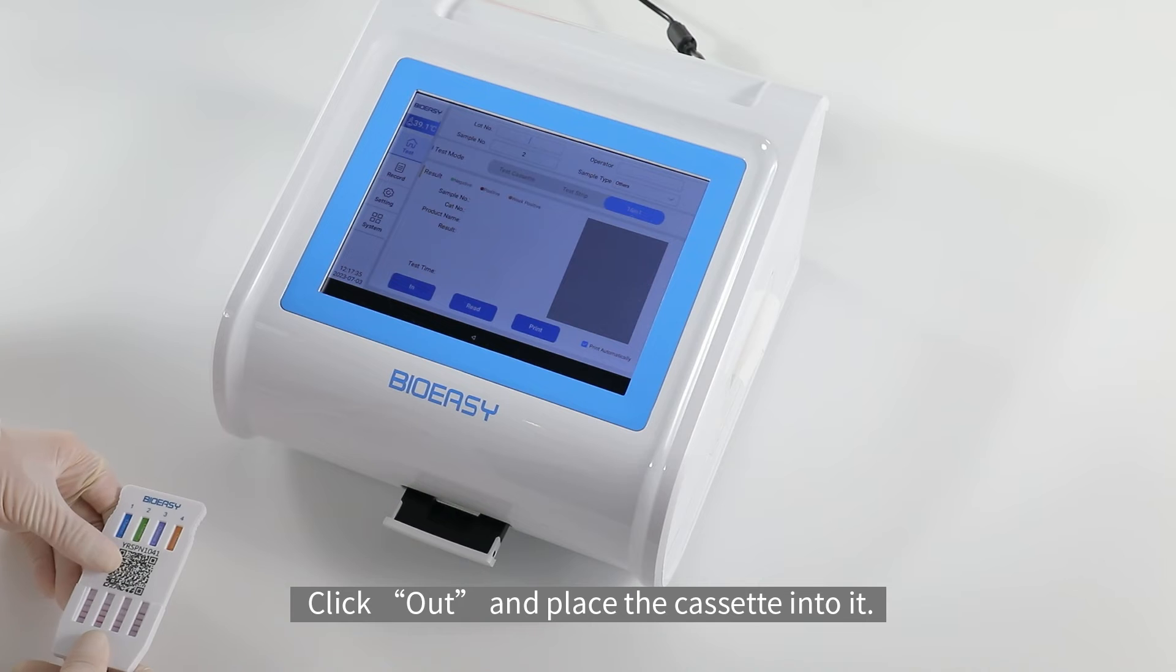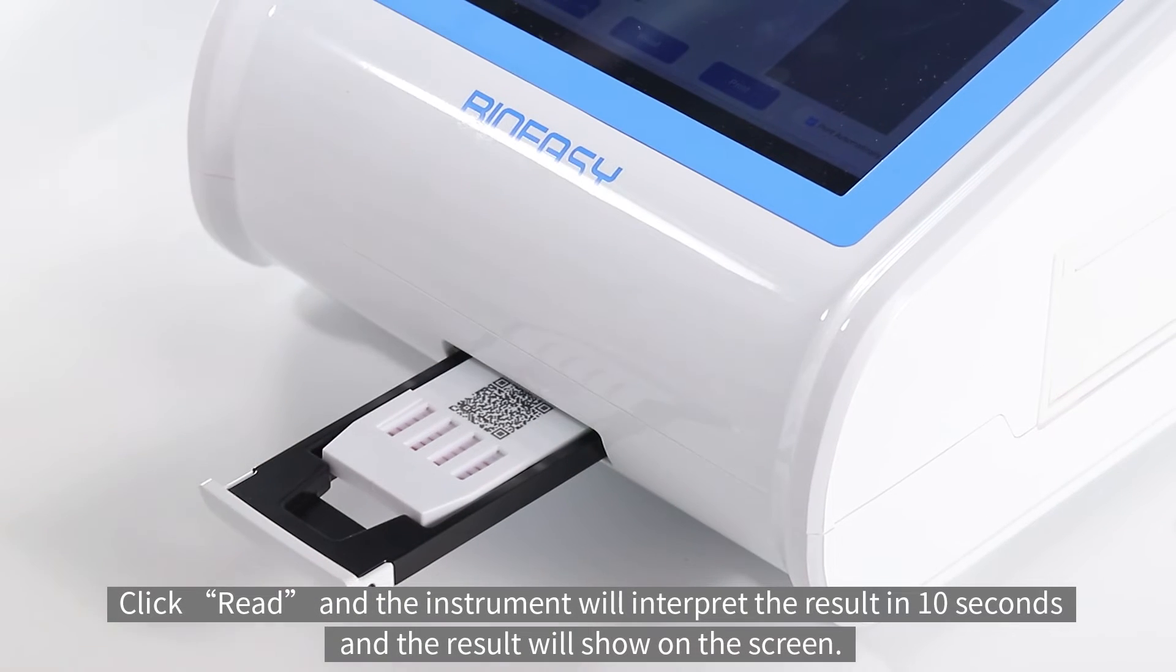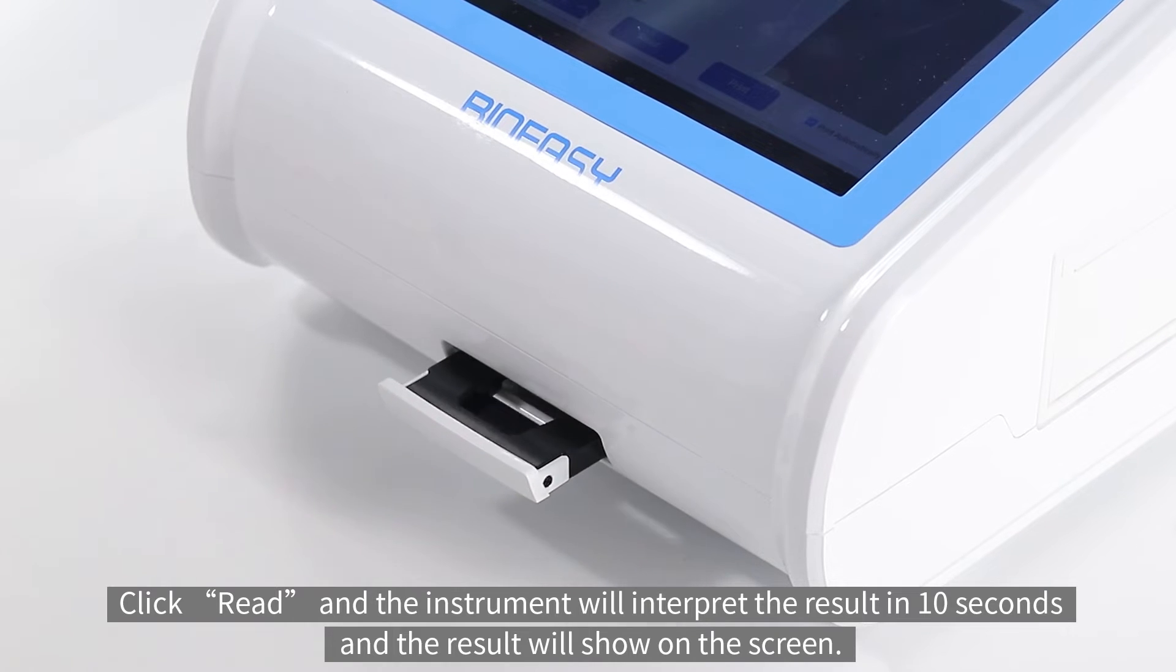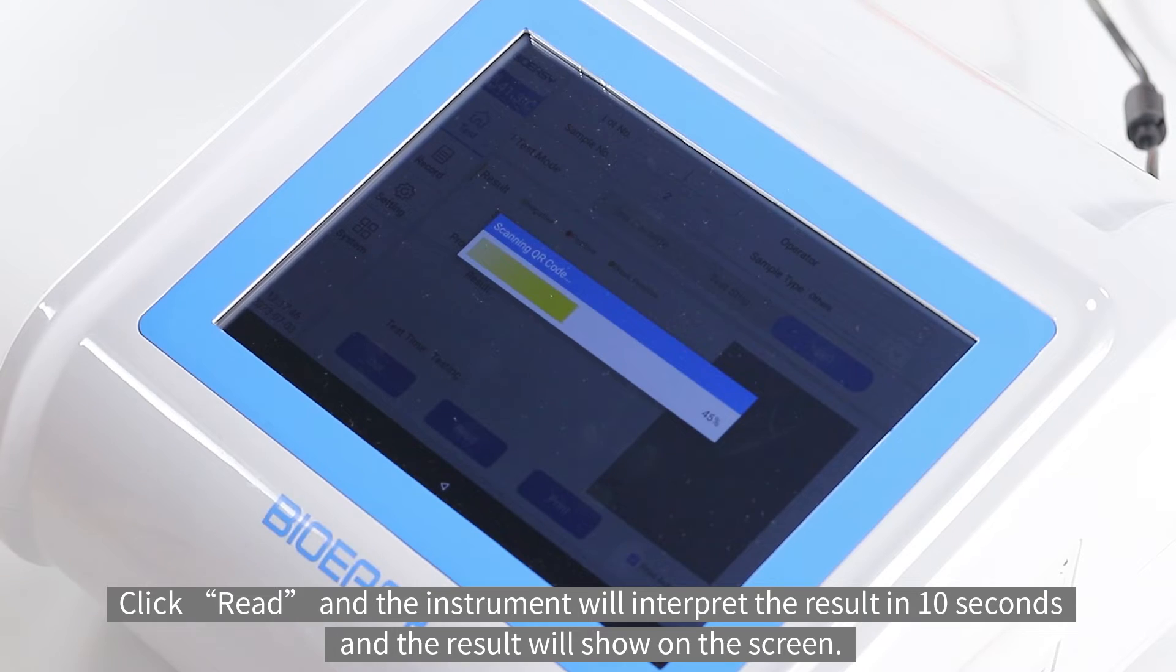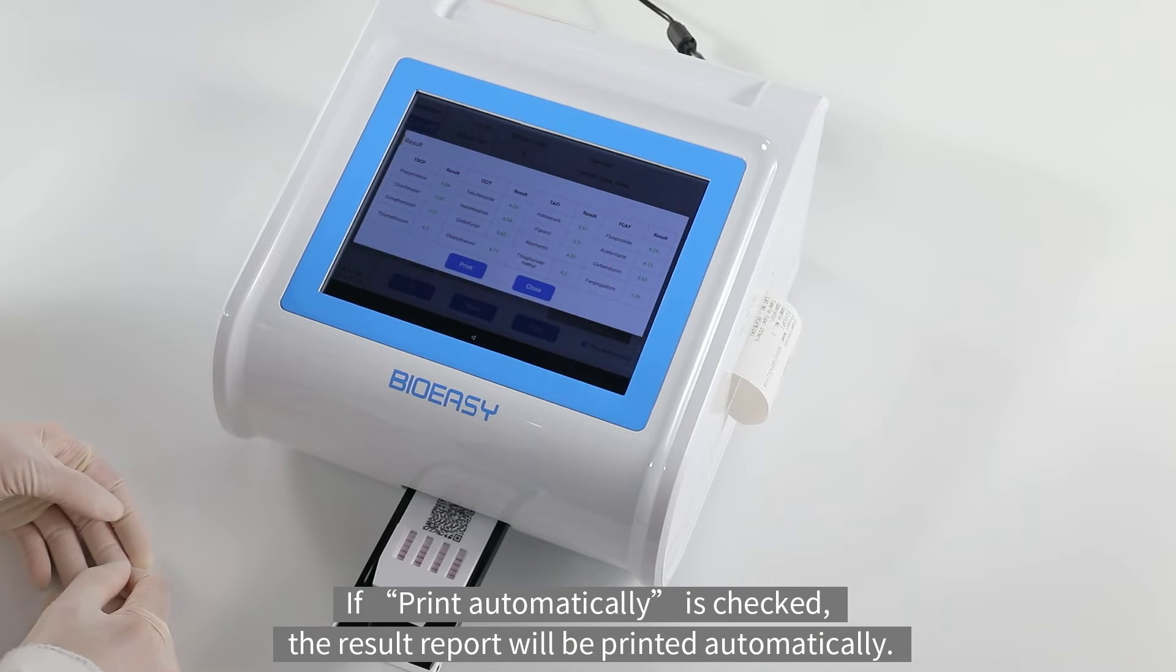Click out and place the cassette into it. Click read and the instrument will interpret the result in 10 seconds and the result will show on the screen. If print automatically is checked, the result report will be printed automatically.